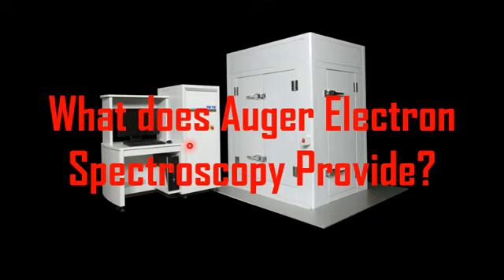This technique cannot be used to analyze the hydrogen and helium atom because they have only one shell, and Auger electron cannot be emitted from one shell. So now let's discuss what Auger electron spectroscopy can give us.